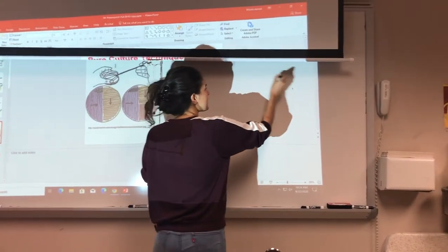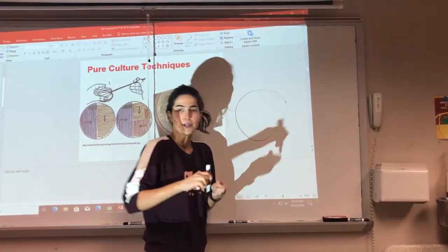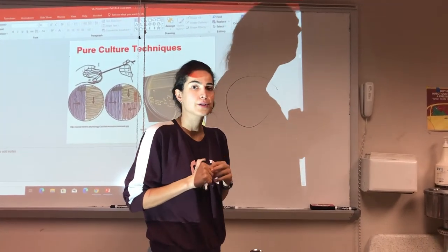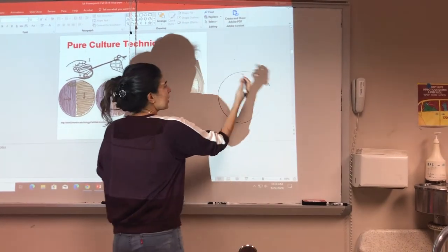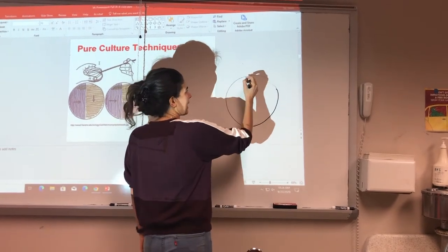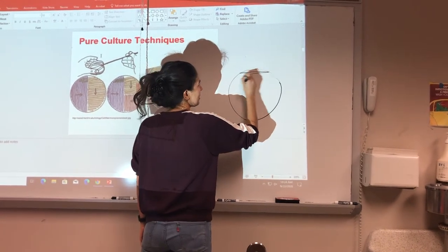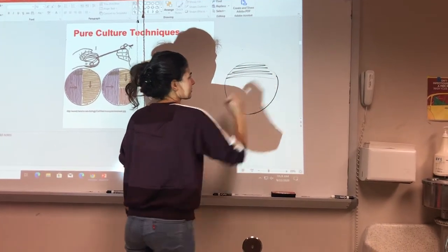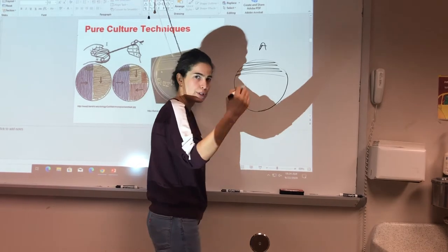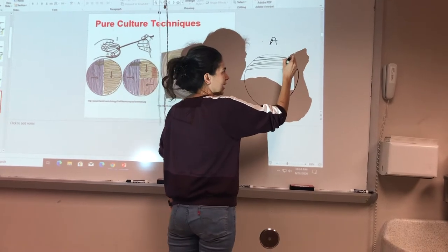If this is the petri dish plate, you need to isolate the bacteria with a loop and sterilize your loop between each streak. Consider this marker as a loop — you will streak on the plate like this. We call this section A. Then you sterilize your loop, grab some inoculum from the A section, and go to B.